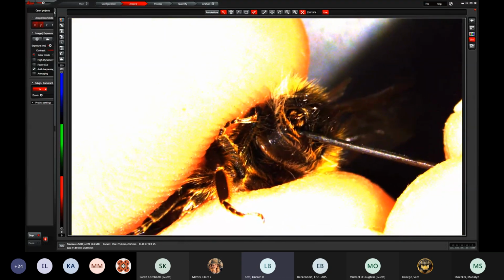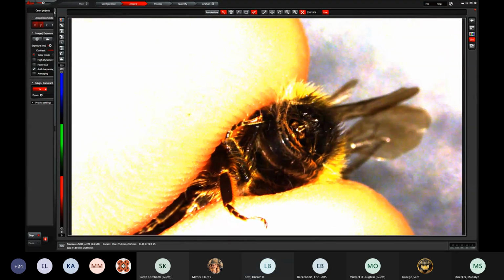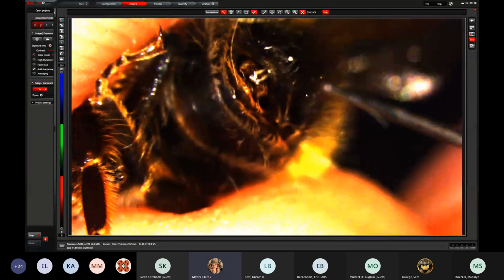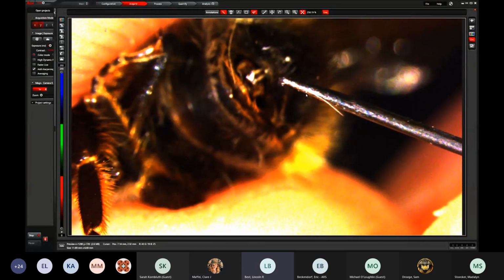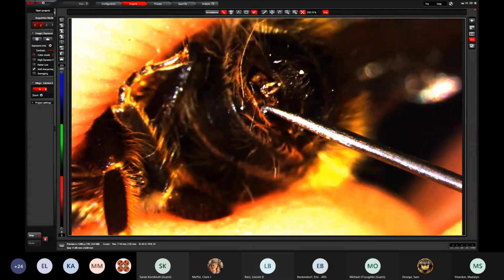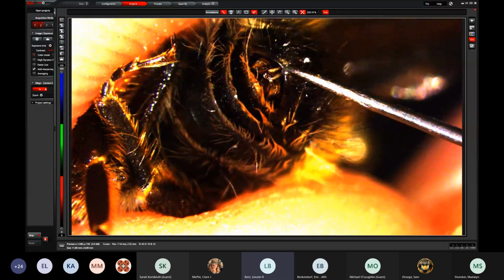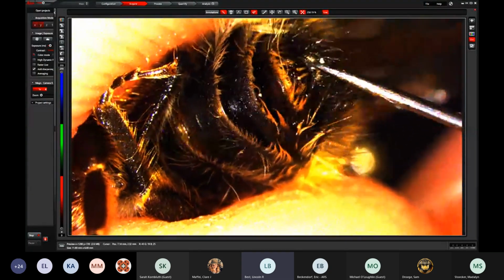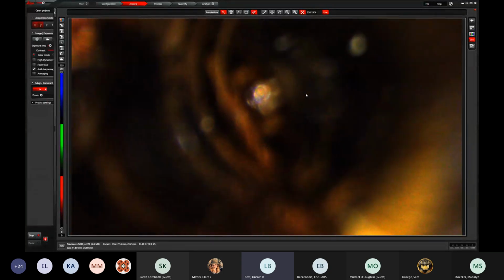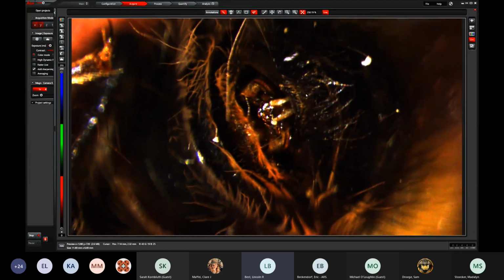So here, you can already see those 2 white lines are the penis valves. Zoom in. This is a perfect shot. The light's a lot better. This is very helpful. Thank you. Okay, so here, just by pushing on S6 or S7, the apical sternite, and pulling on the apical tergite, you can immediately, let me zoom in even more, immediately you can see those structures.